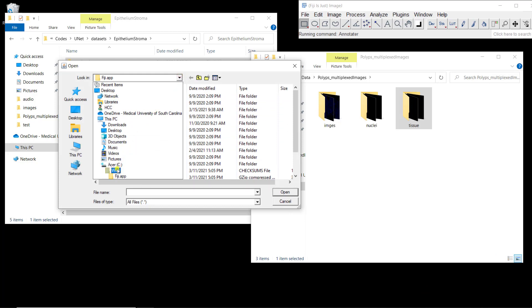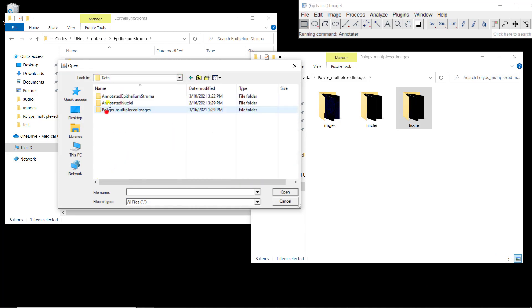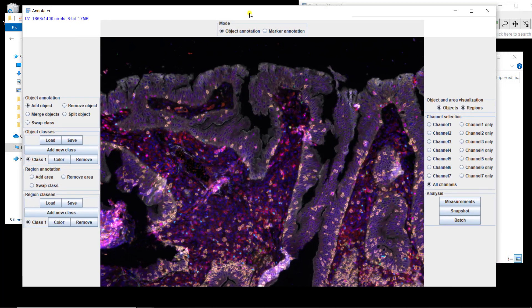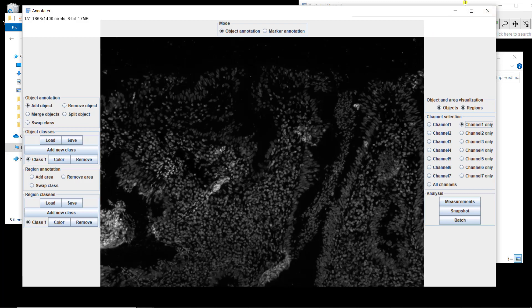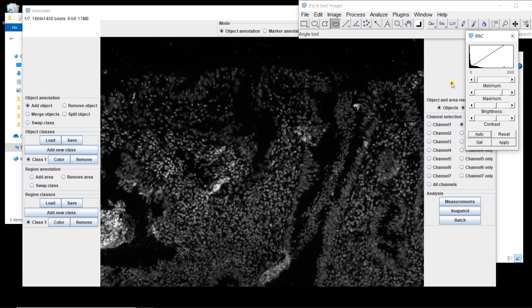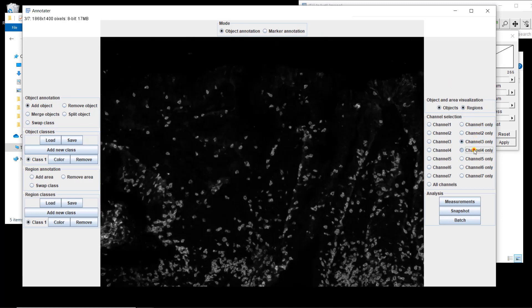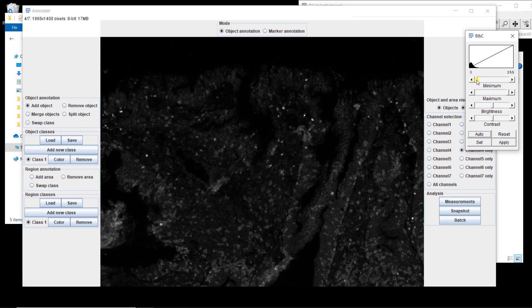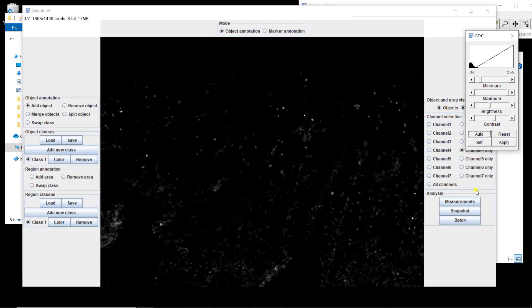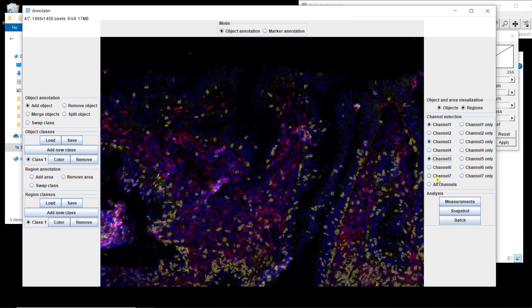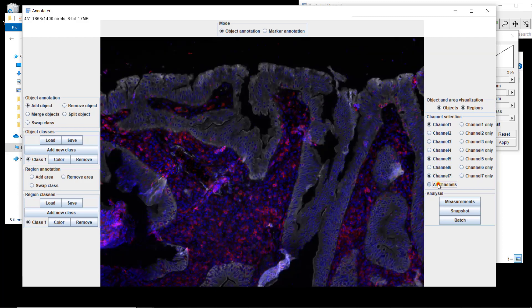I'm going to open the first image. If I go to data, images, polyps multiplexed images, and select the first one, it opens with Annotator. We can look at the different channels one by one in black and white. This is DAPI, this is CD8, and this is ROR-gamma-T — which is a bit non-specific so I'll adjust it to get rid of the background. You can also look at different color combinations, like DAPI, CD8, CD4, remove one, add another. You get the idea. You can put all of them together.